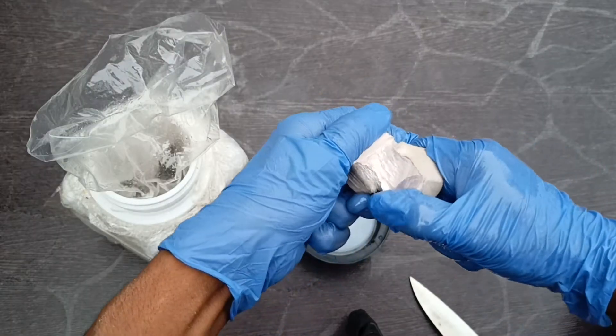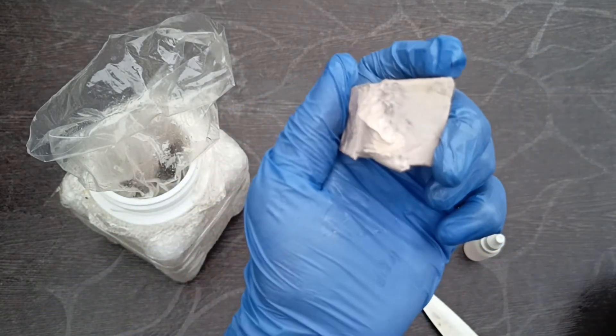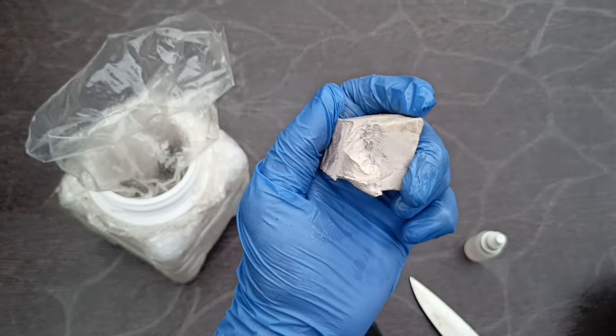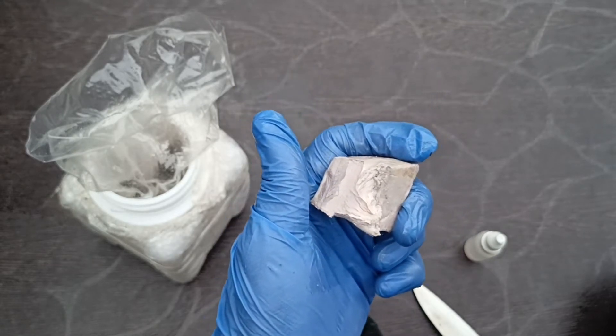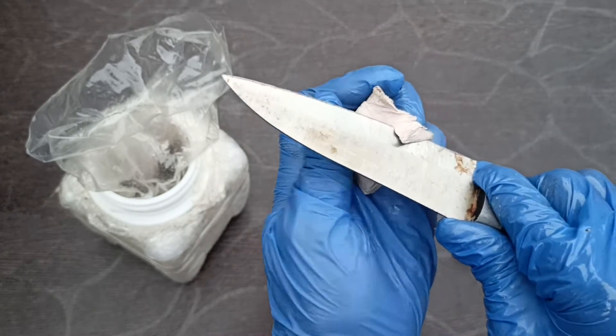Some metals are fun to play with but they are dangerous. Sodium metal is one of them — a soft and shiny metal. But it's aggressive when it reacts with water. In today's video I will show you how it reacts with water and explain the reaction with a demonstration.